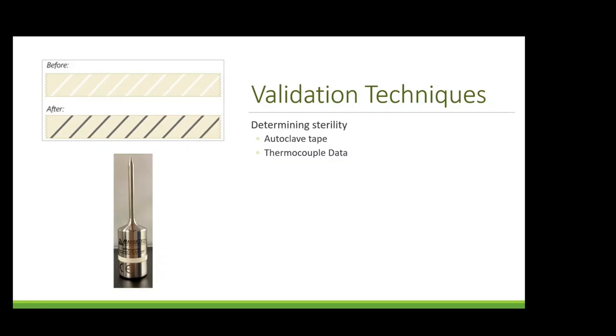Our group chose to purchase the high-temp 140-1 temperature recorder. A picture of the device can be seen on the slide. To validate the autoclave, we ran a normal cycle with a waste bag and temperature recorder. To achieve validation, the autoclave must run at 121 degrees C for at least 30 minutes. The autoclave in the biochemical engineering lab achieved this metric, to be discussed more later in the presentation.